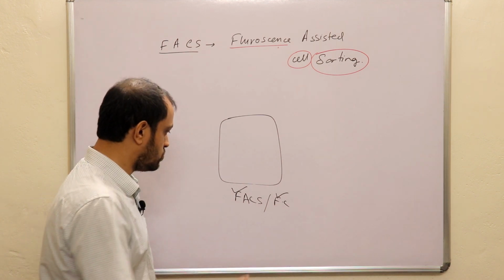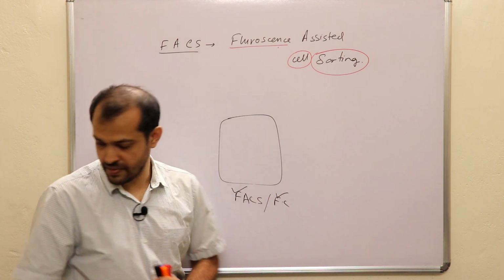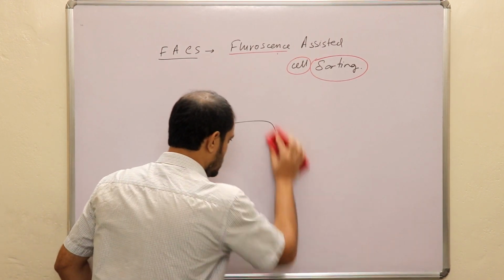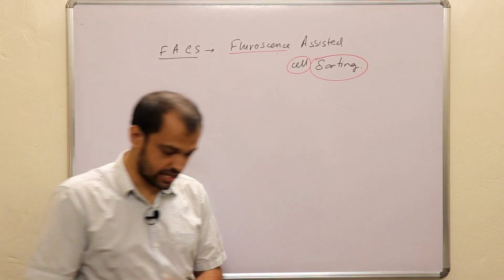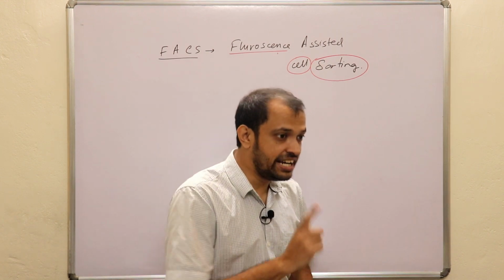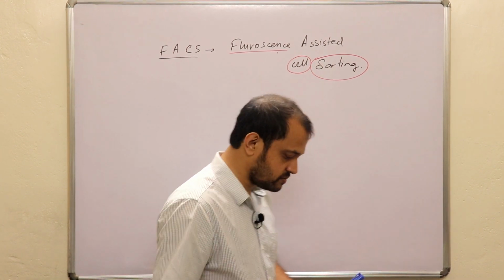Okay. Now today we will be discussing FACS in a very lucid manner. Listen, when we are talking about FACS, you should understand that it is a continuation of the previous lectures. Whenever we talk about FACS, we will have to talk about hydrodynamic focusing, which we have already discussed.